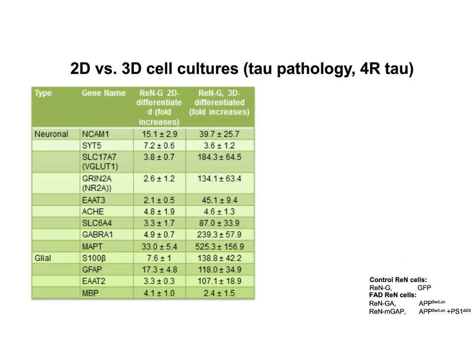So now we switch to the tau pathology, which is the most exciting part of our studies. Before going into the tau, I want to show something about the advantage of 3D culture, not just A beta aggregation, but in terms of recapitulating other neuronal physiology. This is the quantitative RT-PCR analysis of neural markers, which I showed you in one of the previous slides. What we did here is compare the exact same cell line for 7-week differentiation in 2D versus 3D. Even in 2D, you can nicely see that neural markers increased by 15-fold, 33-fold.